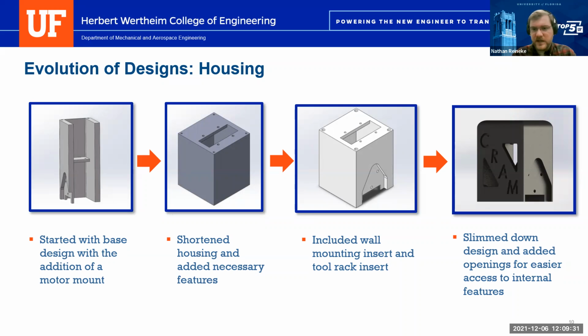We finally wanted to make it aesthetically pleasing, as well as further limit the amount of material that we used, which also limits the amount of time that it takes to actually build on the 3D printer, which led us to create those triangular holes in the side. This also allowed us to put tools inside of it, so we could do diagnostic work if something was failing, as well as do fine tuning if necessary, which luckily we didn't find necessary.